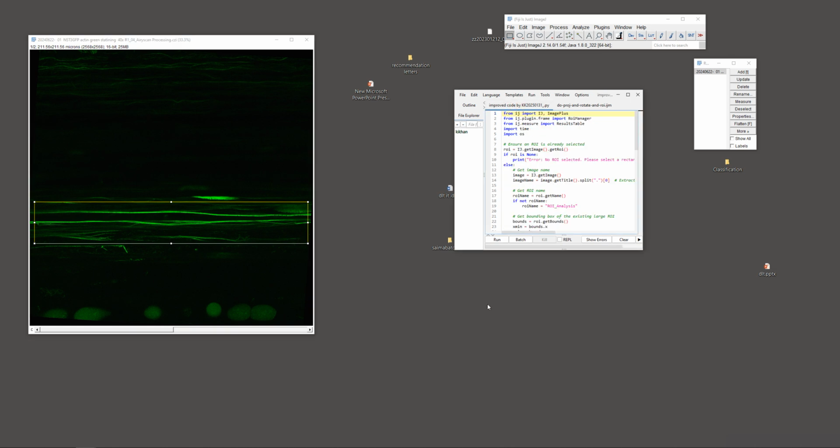Now I will tell you how I measure the intensity, as you were interested in intensity. I know that this first part is not interesting for you, but the second one is. So you just press the run button, and you will see a small window start first. This small window opens here and asks me how much the rectangle width should be.